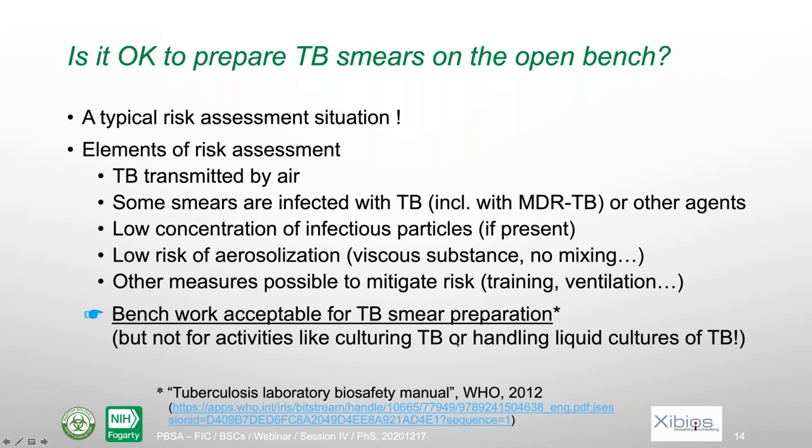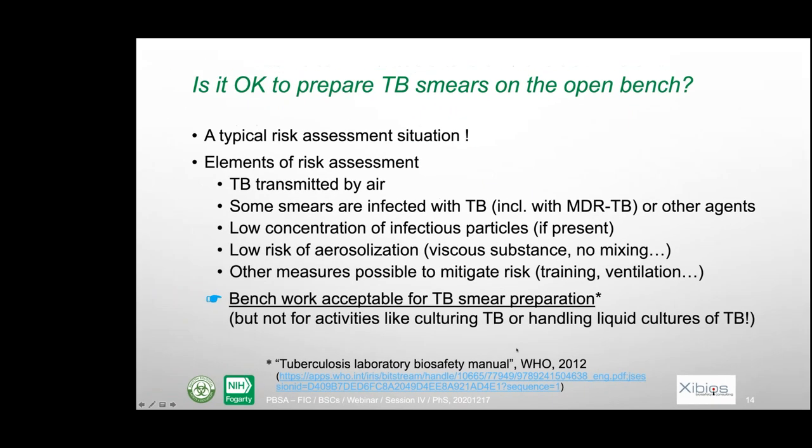But in the same study, they clearly say that for culturing TB, or for any liquid culture of TB, in that case, you need a biosafety cabinet. This really shows very well that risk assessment is key in order to define whether or not you can do something on the bench or you need some kind of protection like a biosafety cabinet. And even for those who don't work on TB, I invite you to have a look at this manual because it's extremely well done and it clearly shows how a risk assessment can be done.